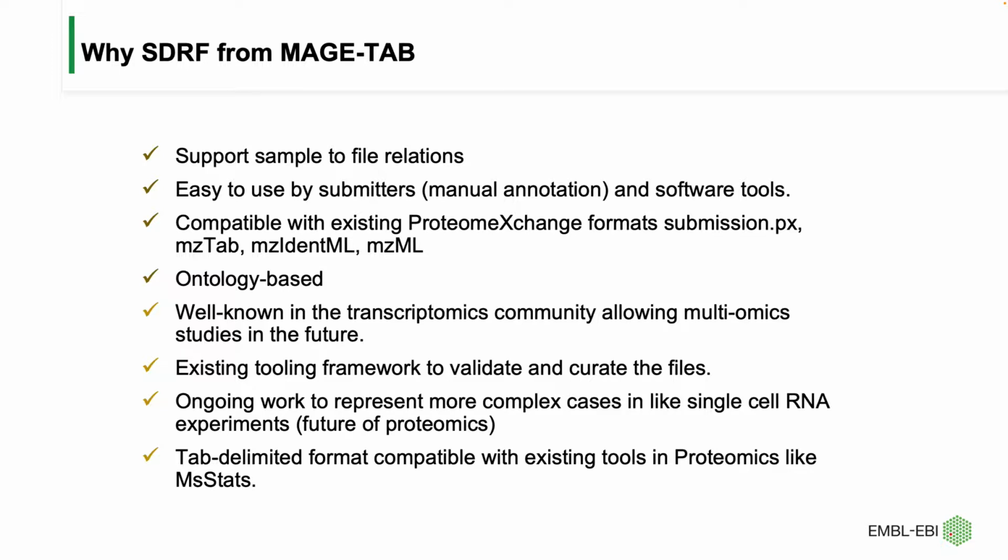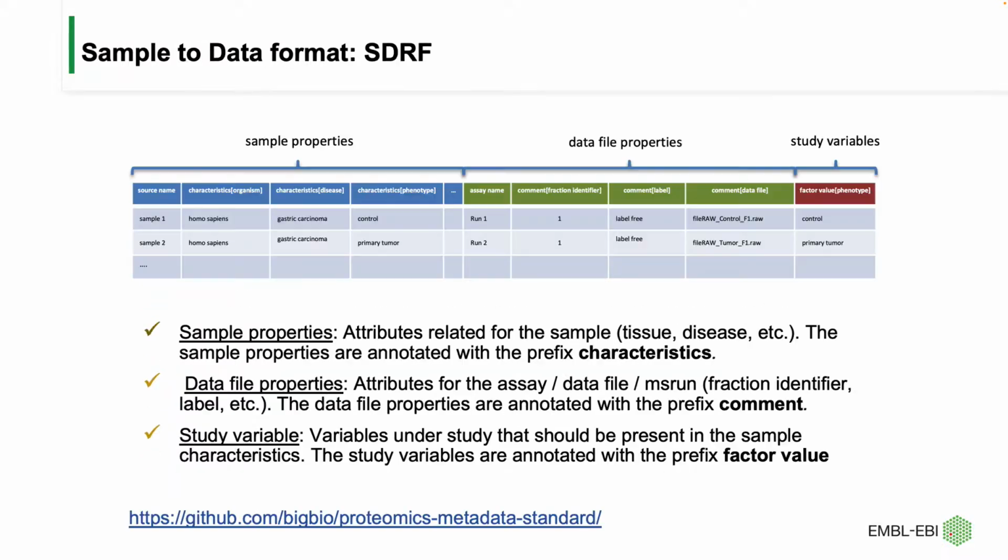The main idea is that we want to reuse the file format for the future, when someone performs a multi-omics experiment and has RNA-seq data deposited in ArrayExpress and proteomics data deposited in PRIDE. They actually use the same file format to describe the files. And there is extensive tooling for validating MAGE-TAB and SDRF, and we will talk a little about that in the last slide.